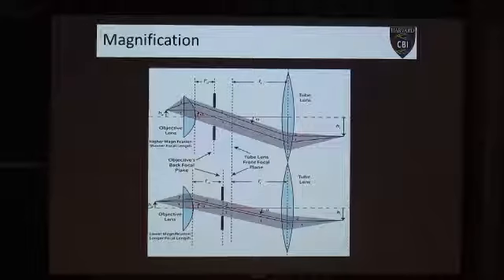So this is why when you're looking on the microscope, you use a 10x objective, and that 10x objective is nowhere near your sample. As soon as you move to a 63x objective, that objective is right there, almost touching your sample. What this also means is that if you have a big, thick sample, say 500 microns or a millimeter in thickness, you can't move all the way through that with your high magnification objective, because it only has a couple hundred microns of working distance before it actually runs into your sample.